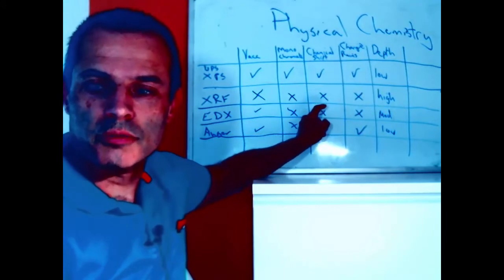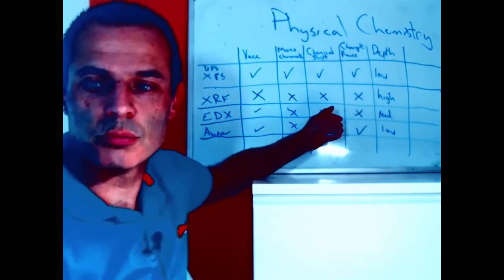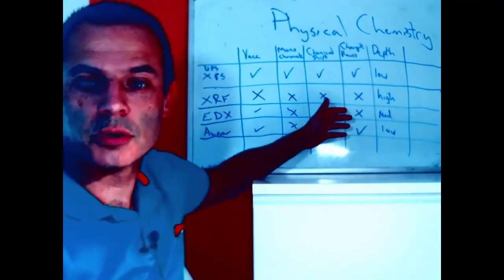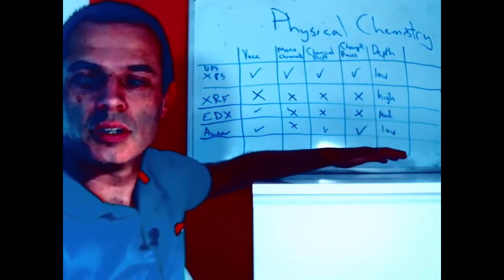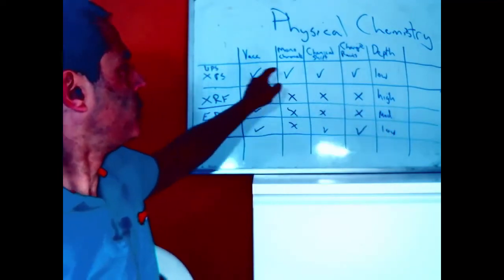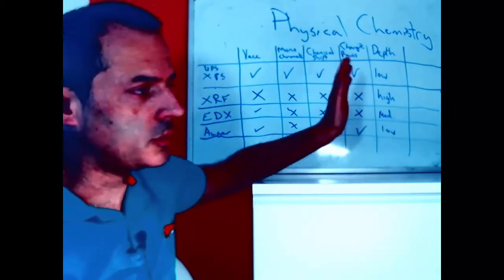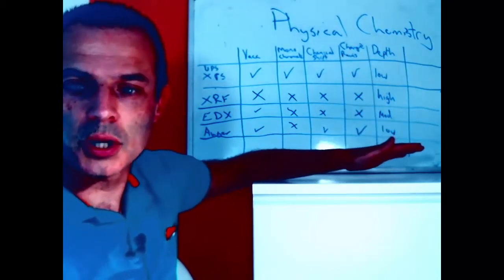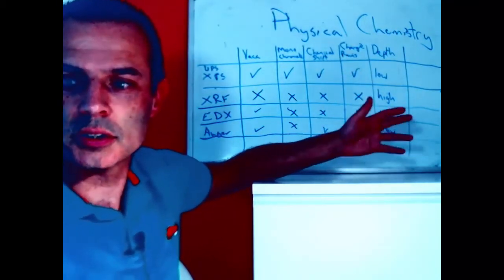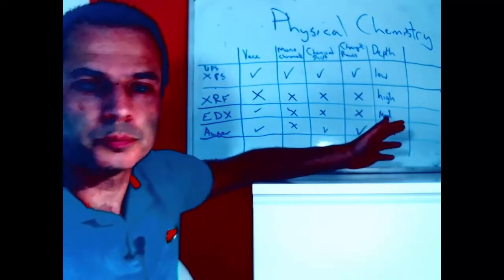The other way round, of course, if we want to measure the general chemical information, but at the surface, we then have a different problem, and so we would have to measure at a lower angle to try to reduce the depth of penetration. We can also do that with X-ray photoelectron spectroscopy. If we rotate our detector to a lower angle, particularly the detector, because that's the thing that's got the lower energy, the electrons coming out.